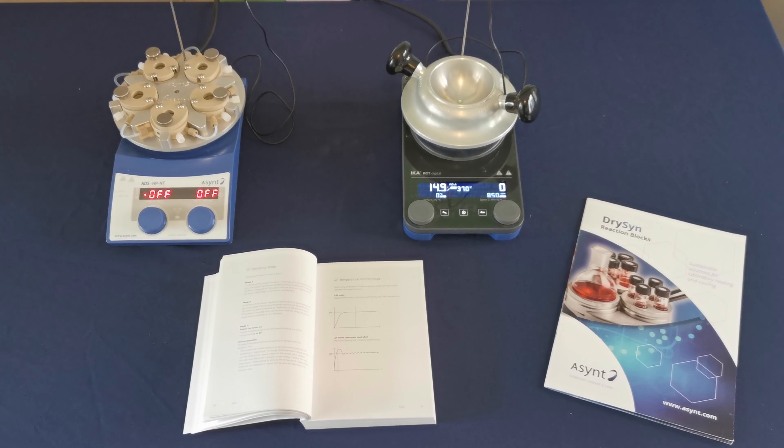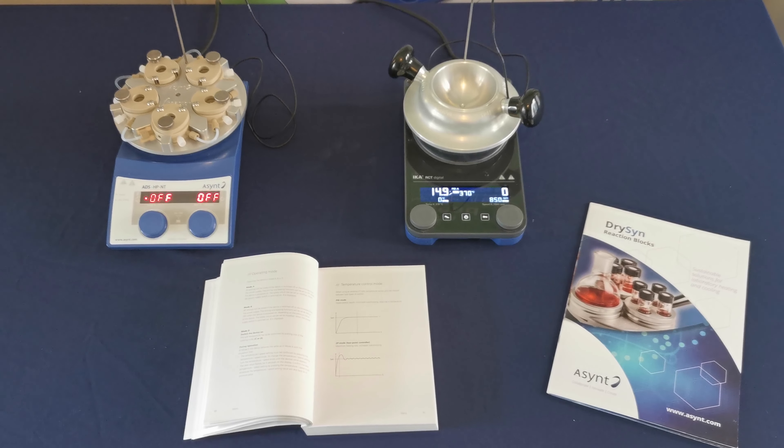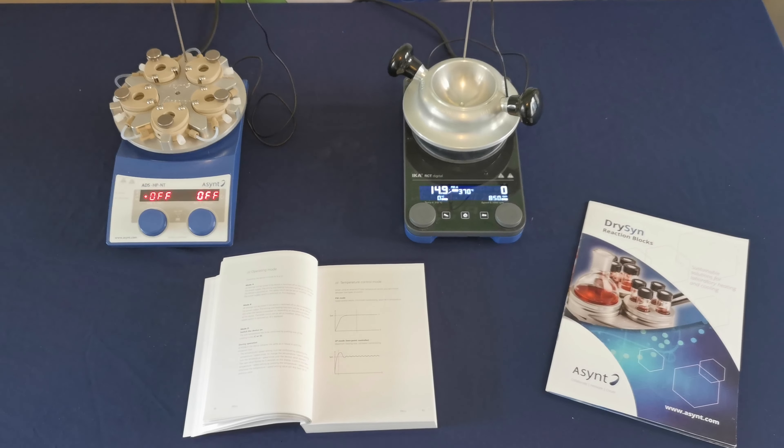Hi, this is Mike from Asynt and today's Did You Know video is about the Asynt hotplate stirrers. I have the standard Asynt hotplate stirrer on the left and the RCT Digital on the right.